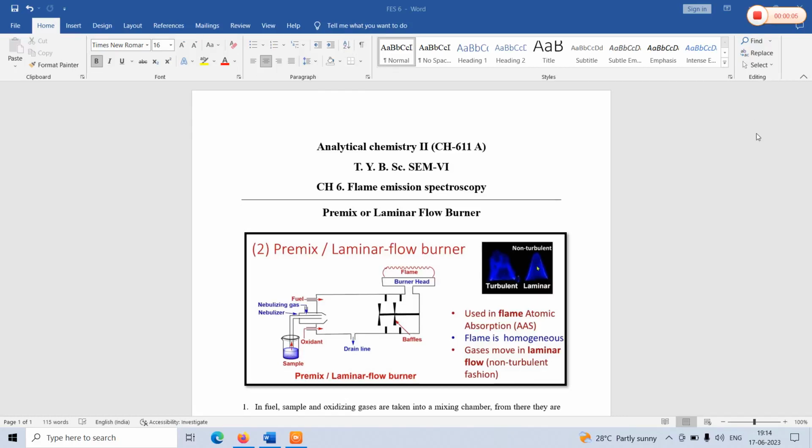Good morning friends, this is a series of lectures for T.Y.B.Sc Analytical Chemistry, semester 6 students, and the course of this analytical chemistry is CH611A, chapter number 6, flame emission spectroscopy.